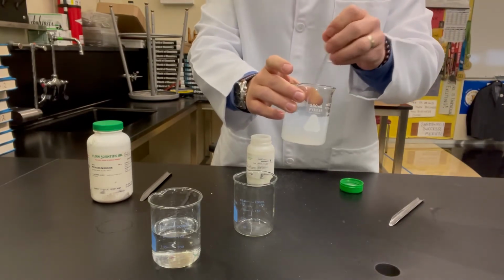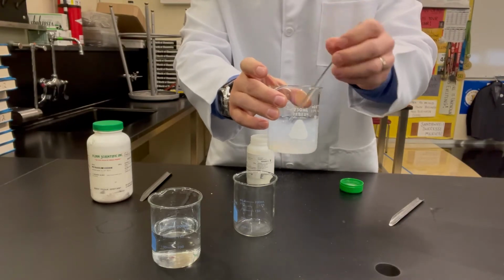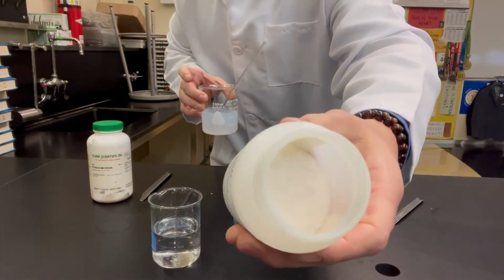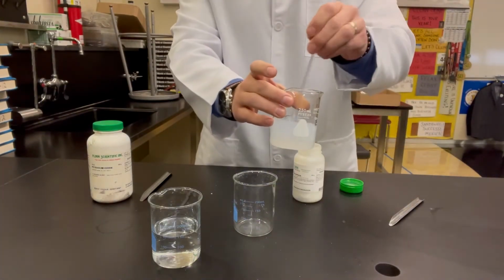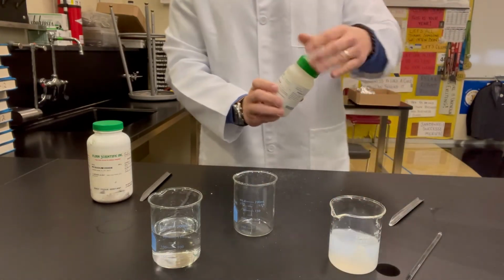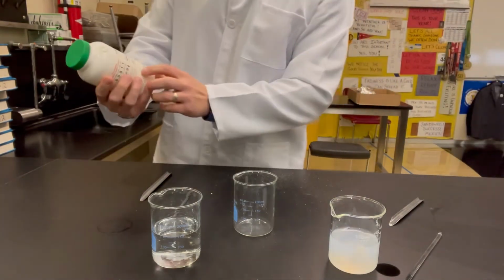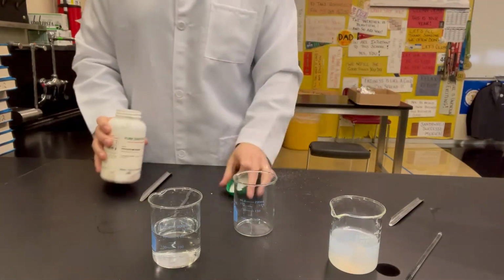So when we talk about that with double replacements, what does aqueous mean? It means that it was a solid powder, but now dissolved in water. Okay? So there we go. I have now my aqueous solution of lead 2 nitrate. I also want to take my potassium iodide and do the same.